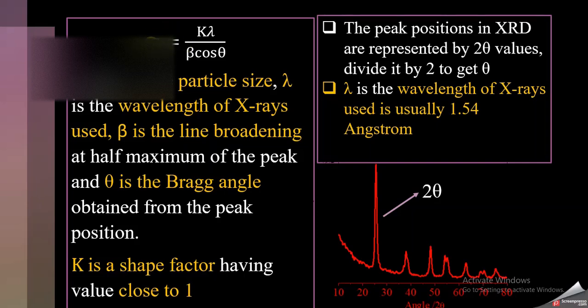After finding the particle size, you may convert it into nanometers, because usually the particle size is represented in nanometers. So this is how you can calculate the particle size of nanoparticles using your XRD data.